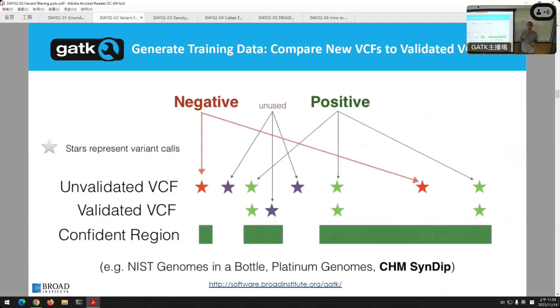So for example, what we do at the Broad is whenever we create a call set, we add in NA12878. Even if she's not part of the project, we always add her in. We sequence her all the time. We must have sequenced her thousands and thousands of times at the Broad. Okay, and this way, when they get new machines or they update the chemistry, we always have new models with her. Okay, so she's always included in the call set. Actually, we include her husband and daughter also. Okay, so you have a trio. So this way, you know you have some truth data to train on.